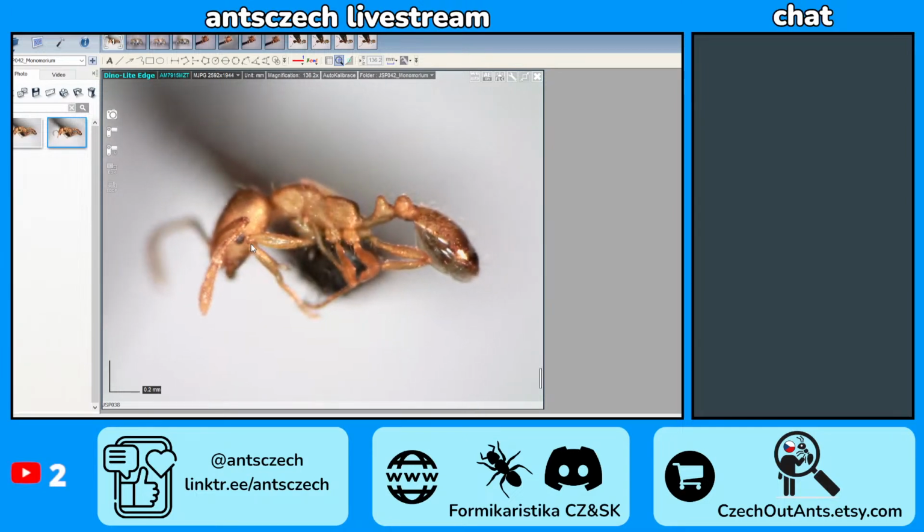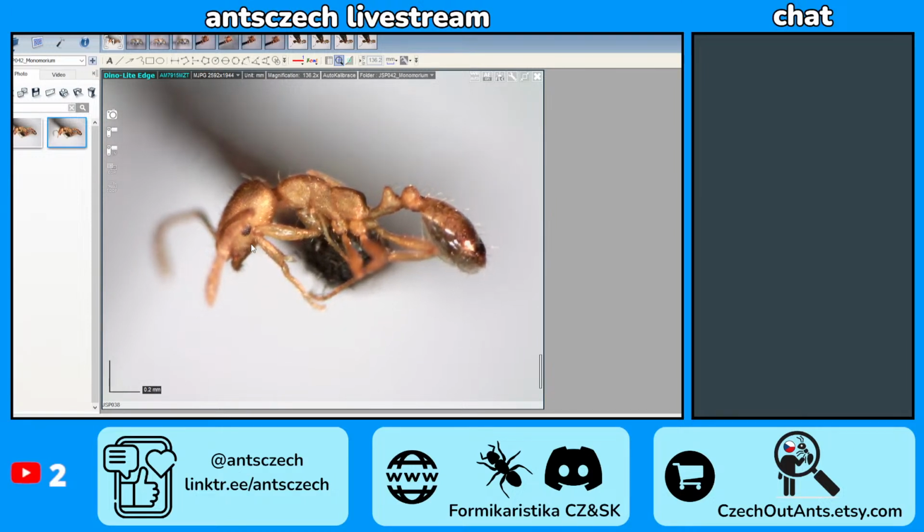The antenna is nicely in the way. Always in the way. At least it doesn't make that many problems when the specimen is bigger. I can see it when it's in the way, but at least here the legs are in the way of the petiole. It always depends on what is needed to make an ID on them.